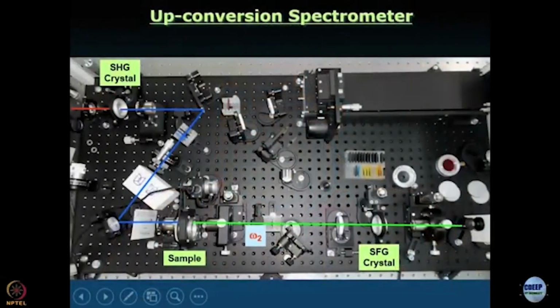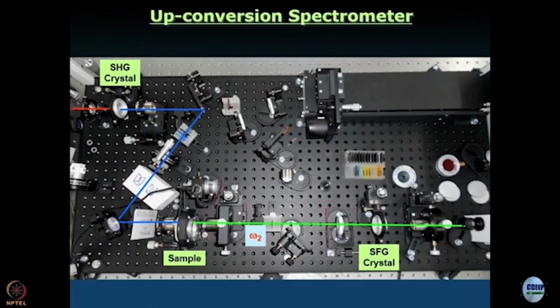All right. So, what do we have? We have this fluorescence going through the long pass filter, which cuts out all the blue light, and only fluorescence light goes through. Here you have a lens. Perhaps you will understand better when we show it to you in 3 dimensions next day. Here you have a lens, and this lens focuses the fluorescence light onto another nonlinear crystal. This one was the SHG crystal, the first one; the second one is called the SFG crystal, because here it means sum frequency generation crystal, not second harmonic generation crystal.